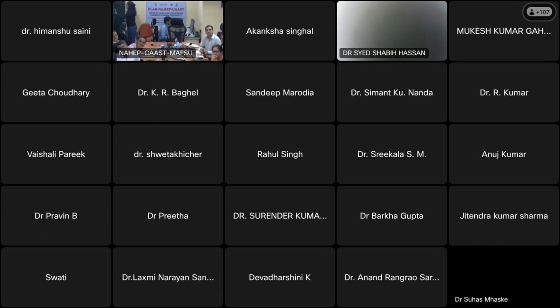And this filter you just wash four times with water. Plain water. Normal liquid water. And this tube also you can recycle. So at the end you don't need to buy any plastic at all. Buy only filter and recycle.